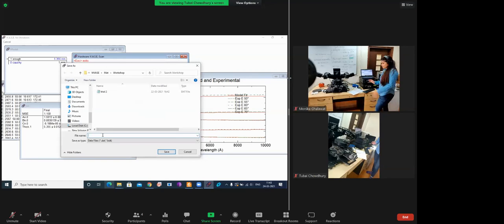Why I'm saying we can use alignment here is because the detector is detecting the signal, but not properly. That's why we will get some information, but not full information.